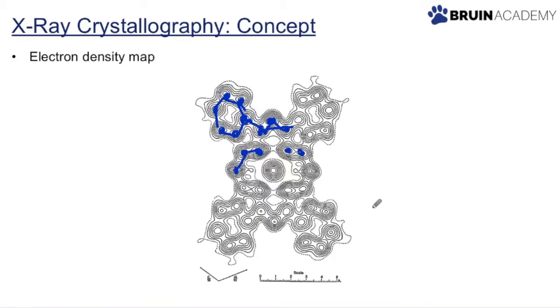So this gives us information about where the electrons lie in the molecule, and you can imagine this is kind of like a slice or an image, a 2D image of the compound in question, if we were just to simply maybe cut down into the pi cloud and look at it, kind of like an MRI image, if you've seen one of those, where you just kind of cut a slice into the brain and see what it looks like from a 2D perspective. That's kind of what it is with this atom here.